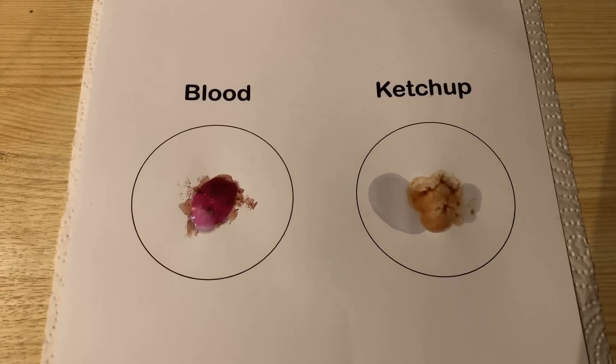The sensitivity of the Kastle-Meyer test is approximately 1 to 10,000. To date, no substance other than hemoglobin is known to react to the test.